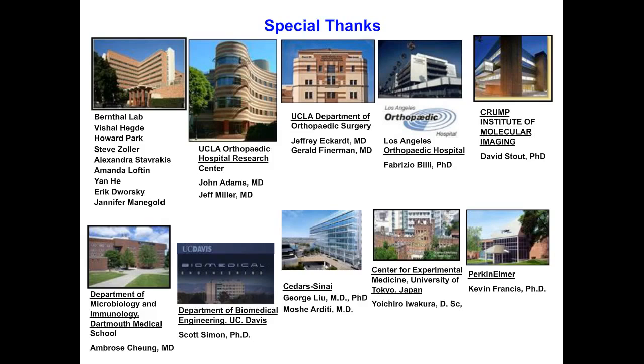Thank you very much, Dr. Bernthal. Now, our next question is for Dr. Lee. Dr. Lee, what instrument parameters can I adjust to increase the sensitivity of detection in luciferin imaging using Lumina 3? Will increasing the dosage of luciferin increase the sensitivity of detection? This is question number 4.